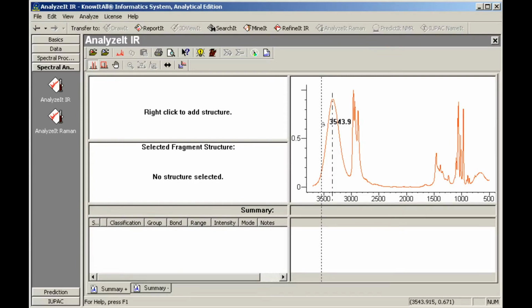If desired, the peak selection line can be moved anywhere in the spectrum, even areas where no peak is present. Move the cursor over the peak selection line until the cursor changes shape. Then click and drag the line to a new location. The new position can then be correlated.